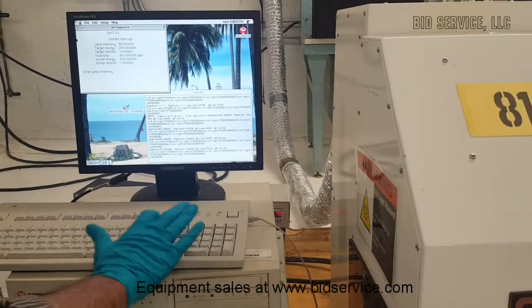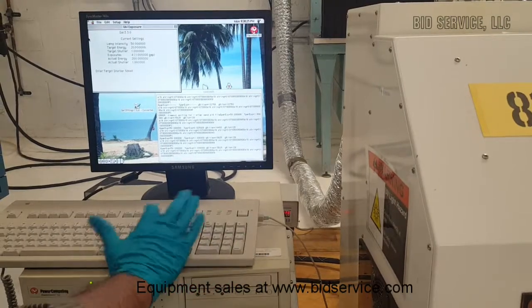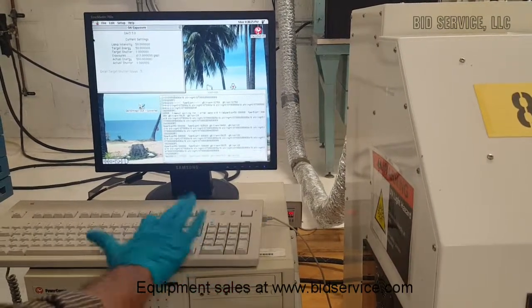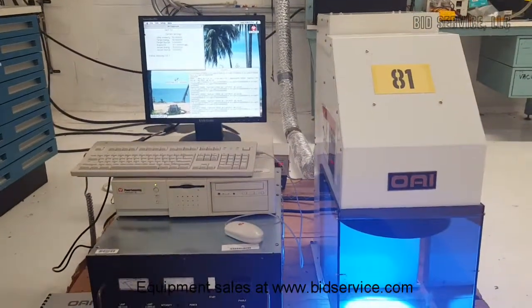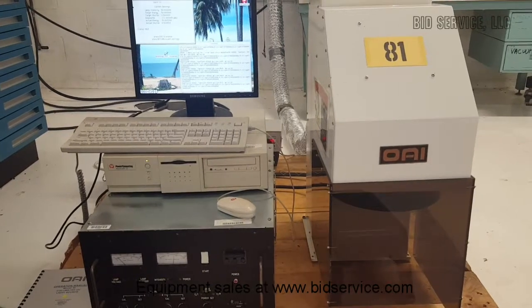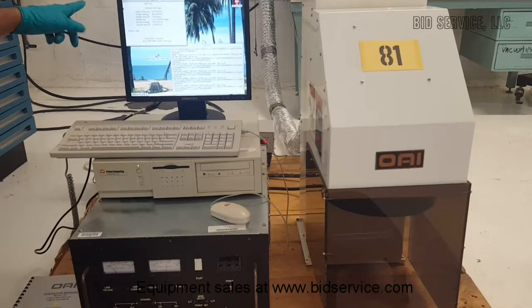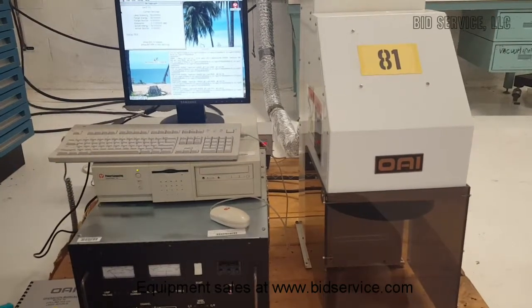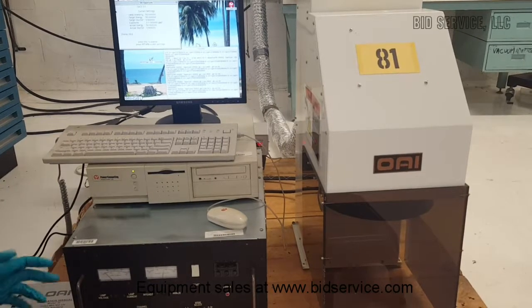Say for example, if I only enter shutter speed 25, in order to get the target energy, the shutter was open for about 0.5 seconds twice.